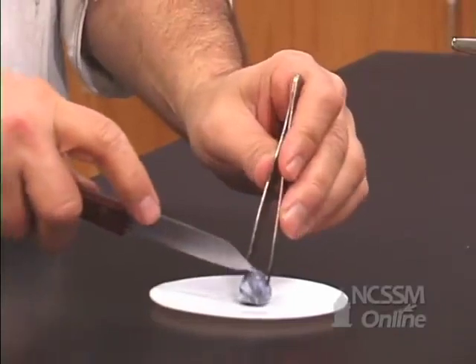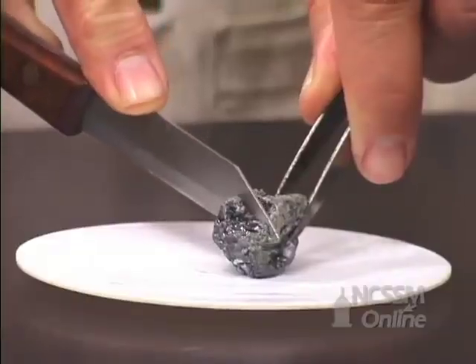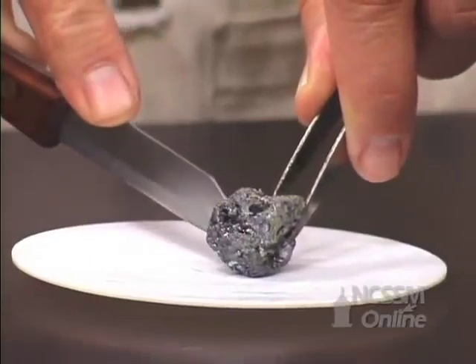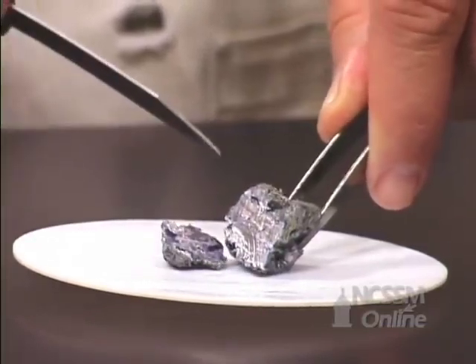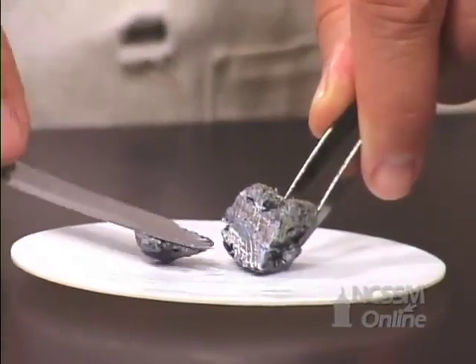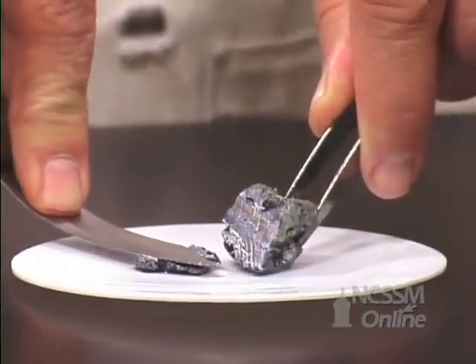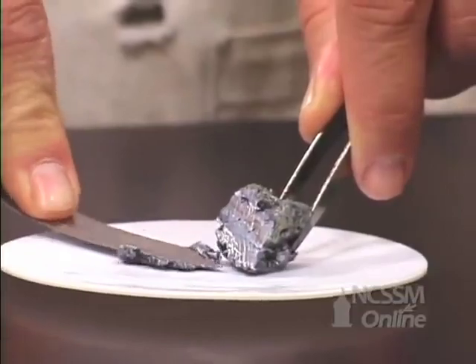As we continue down the column, group 1 metals get softer and softer. The potassium cuts very easily. As we cut through the metal, we expose the shiny metal surface underneath. The potassium is extremely soft — we can easily flatten it out. It has a consistency of cream cheese.